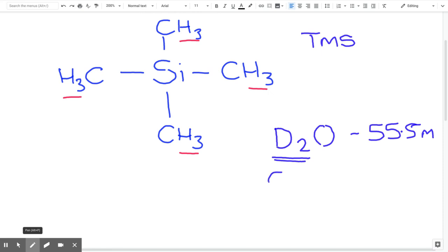Other solvents, if it doesn't happen to dissolve in water, you could use chloroform, so CDCl3, again no protons, or take an analogous version of methane and not have any deuteriums in it either, and have something such as tetrachloromethane. Organic solvents or an aqueous solvent, but importantly, remove the hydrogens from the solvent so that they don't swamp your sample. Put a small amount of TMS in it, and then place it into your machine, and then you generate the spectrum.